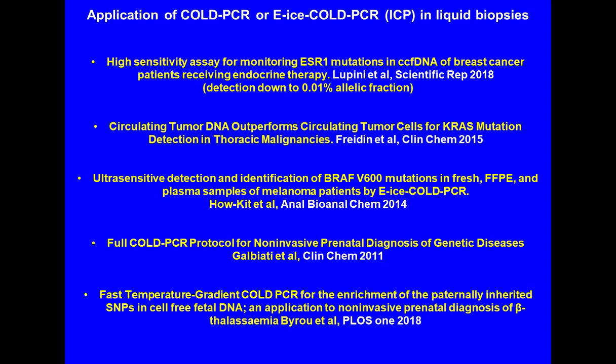So further applications of the ICE-COLD-PCR technology with liquid biopsies are listed here for anyone that has time to read that. Many nice studies have been shown recently, and they keep increasing, for application of ice-cold PCR with liquid biopsies in several clinical situations. The first 3 papers at the top are for cancer. The 2 papers below that are for prenatal diagnosis.